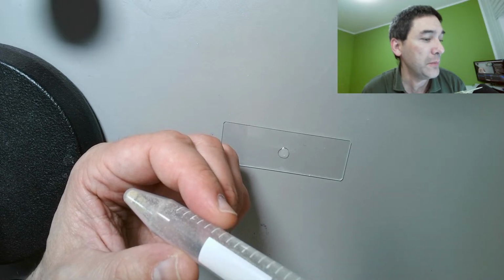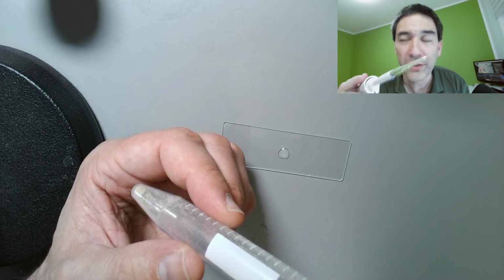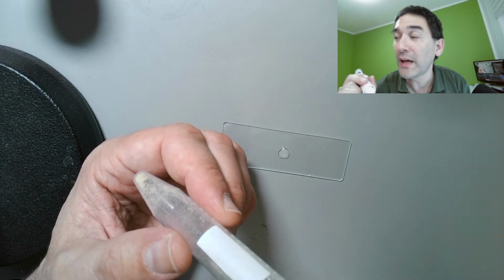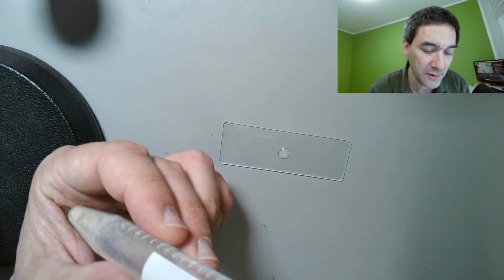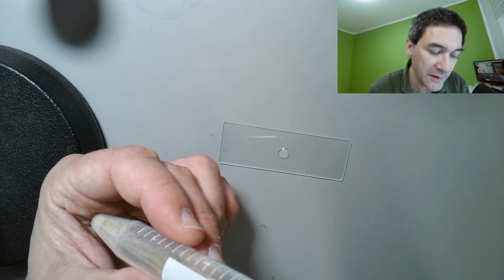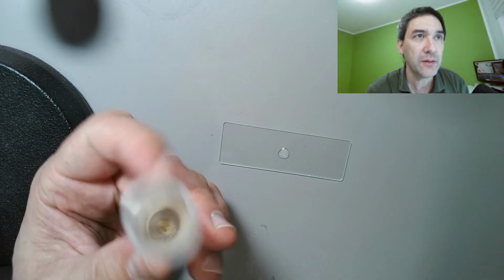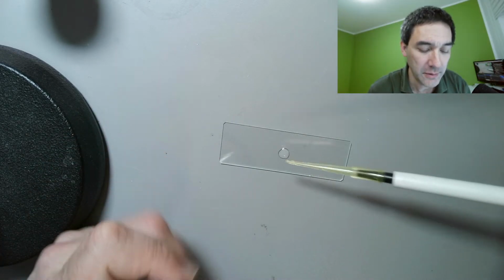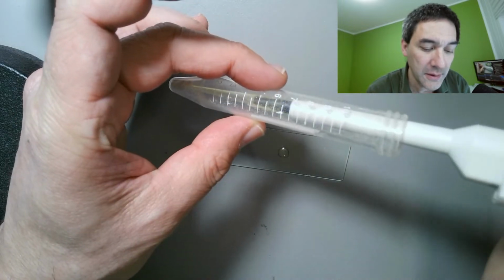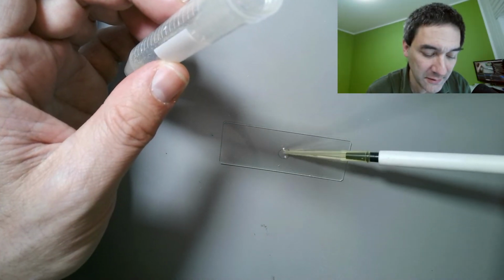One on my stereo microscope, then the one here, the desk, 2, 3, the one that I'm looking in right now for the stage, 4, the other camera on the other one over here, a microphone, lots of cameras. And I think that every now and then this could also be an electricity problem, that sometimes the cameras stop working. So I picked up a little bit of what I hoped to be Sahara sand.